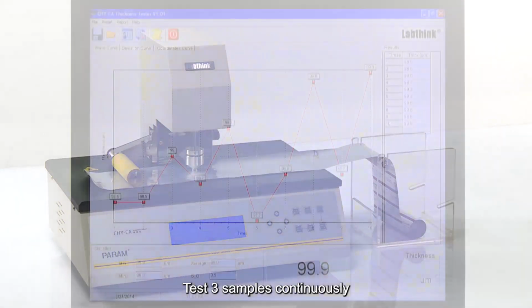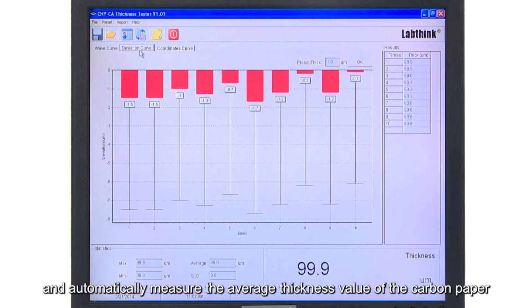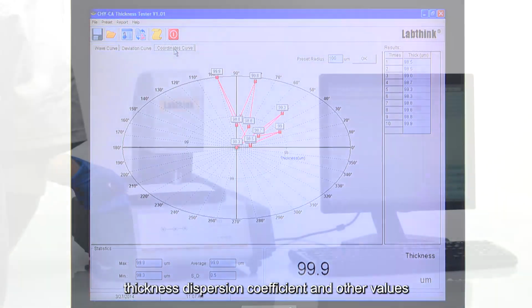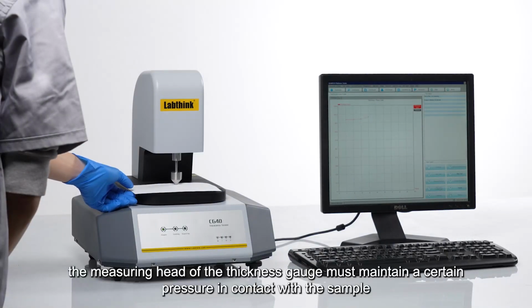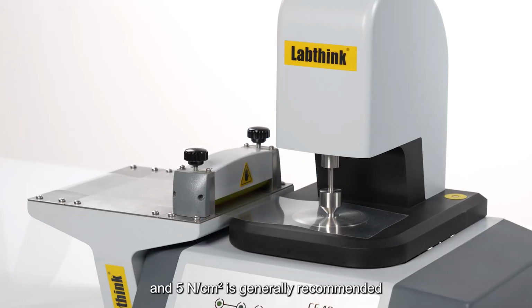Test 3 samples continuously, and automatically measure the average thickness value of the carbon paper, thereby calculating the thickness standard deviation, thickness dispersion coefficient and other values. During the test, the measuring head of the thickness gauge must maintain a certain pressure in contact with the sample, and 5 newtons per square centimeter is generally recommended.